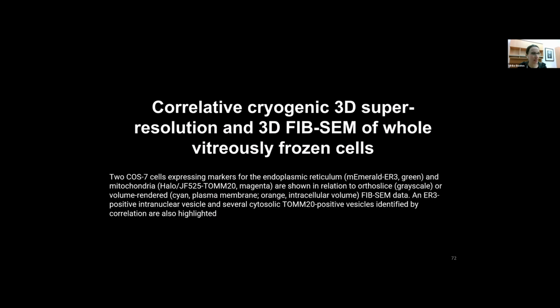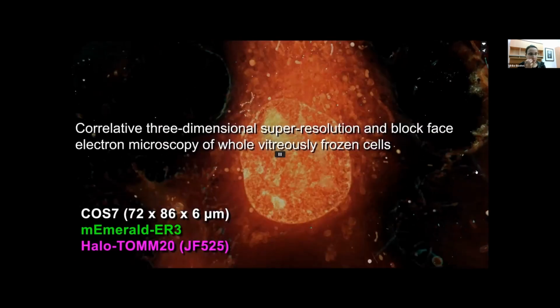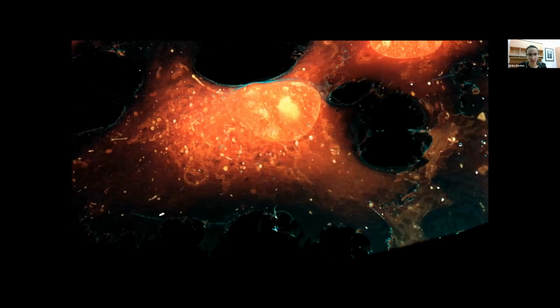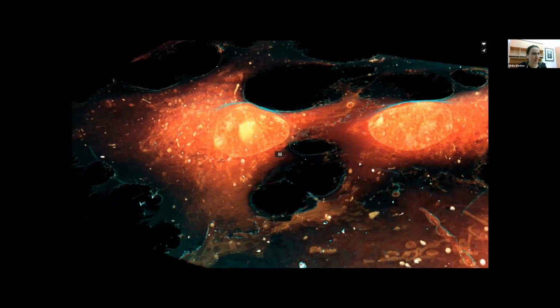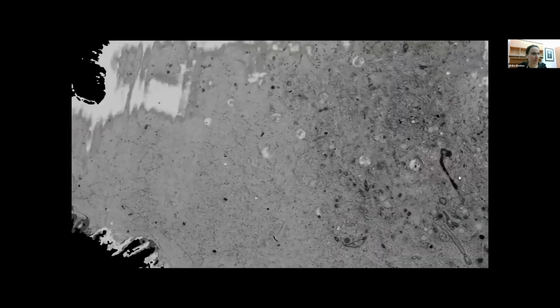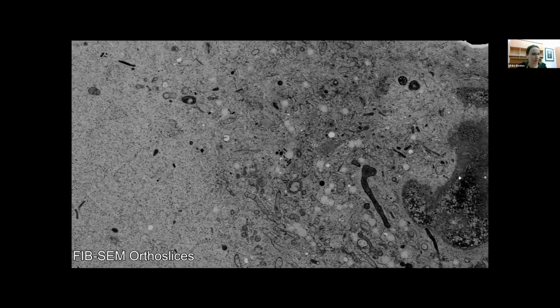And here's just one image taken from a Science paper to highlight how well this actually works. So again, we are flying over cells while you can beautifully see the electron microscopy images taken on the focused ion beam microscope.